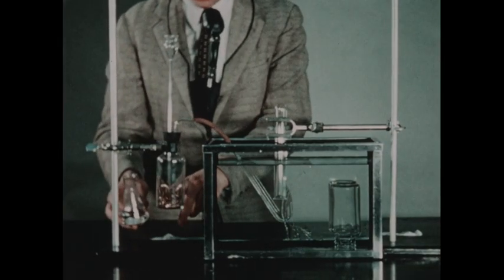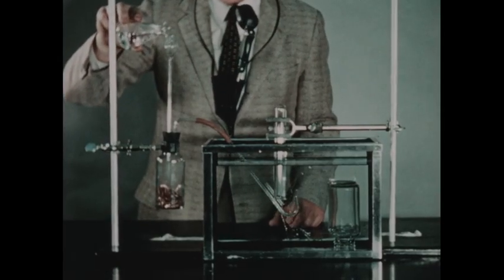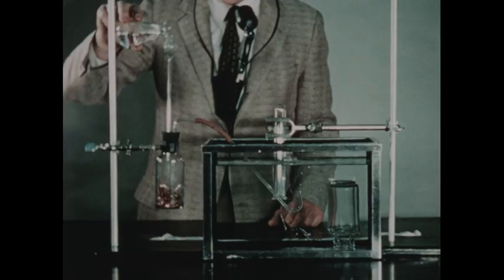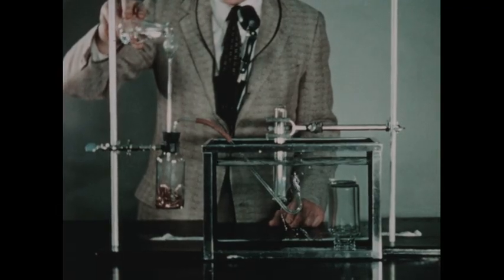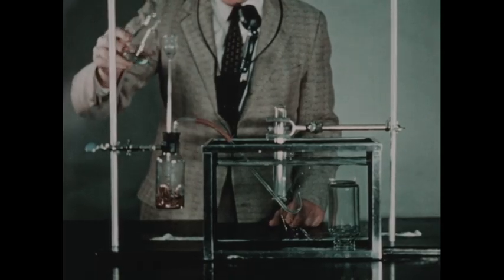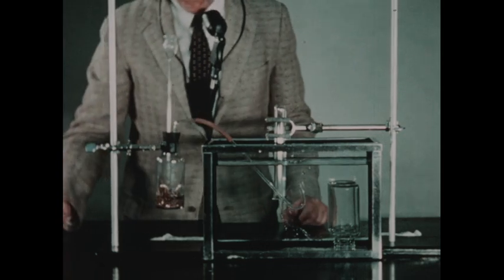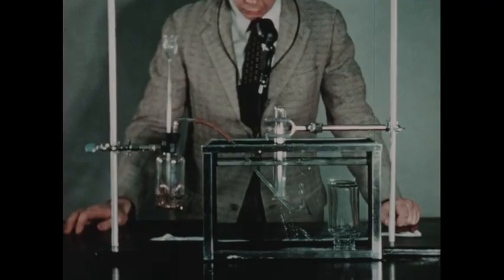In the flask, we have copper turnings. And as we add the nitric acid to the thistle tube, the nitric acid begins to react with the copper, forming nitric oxide.